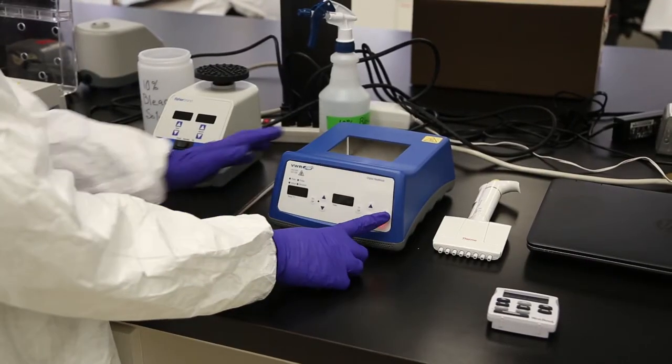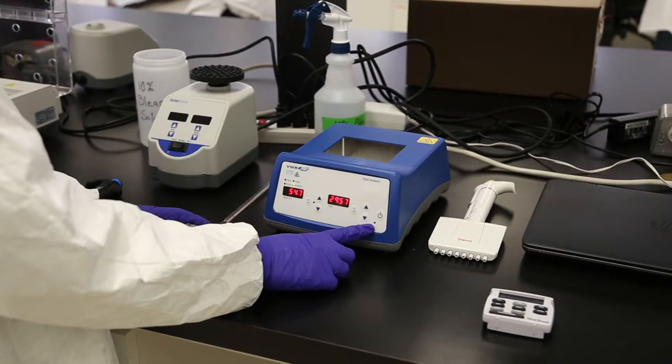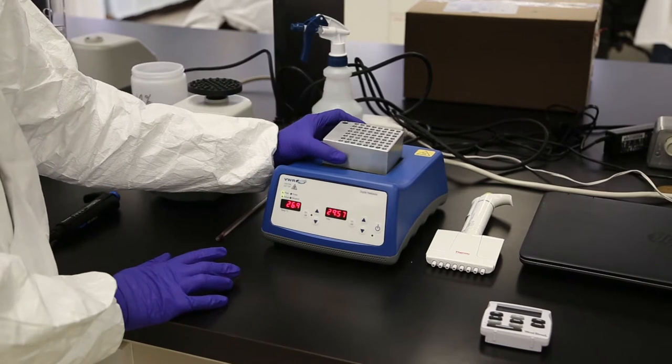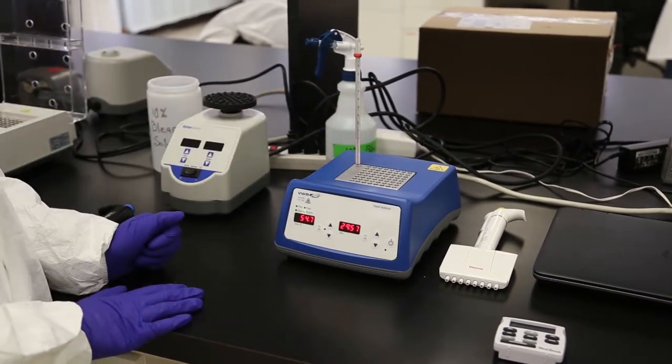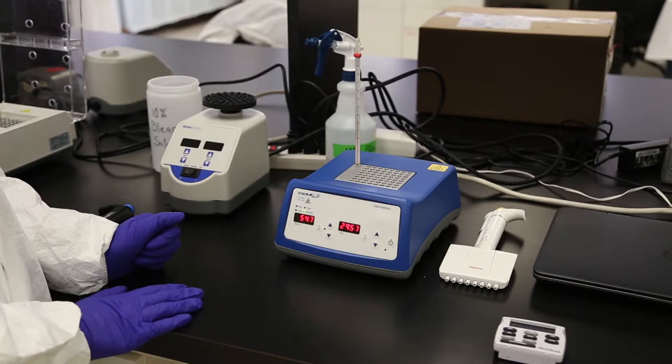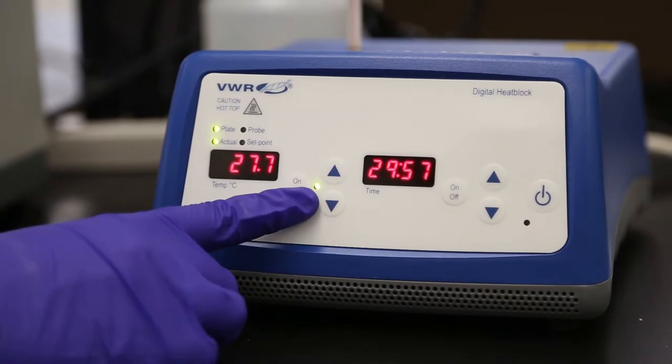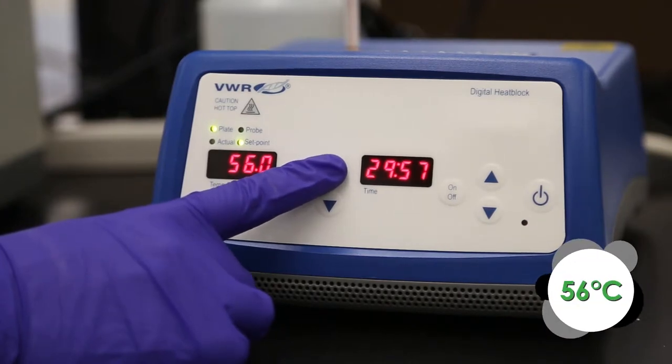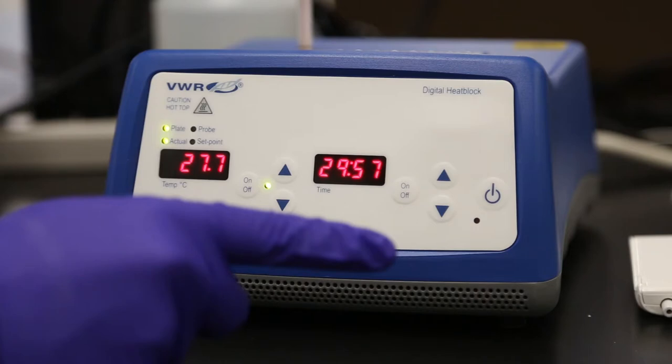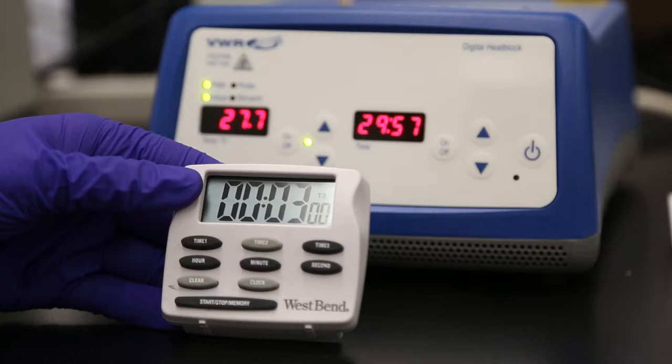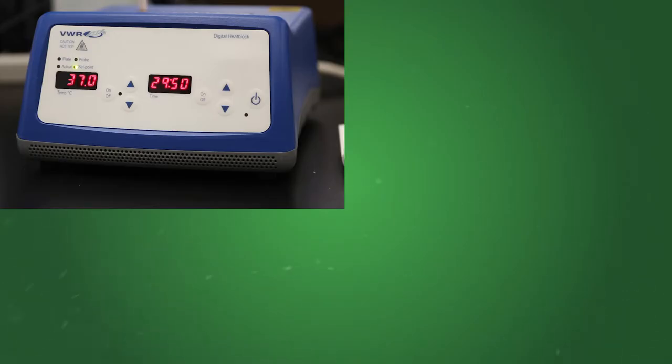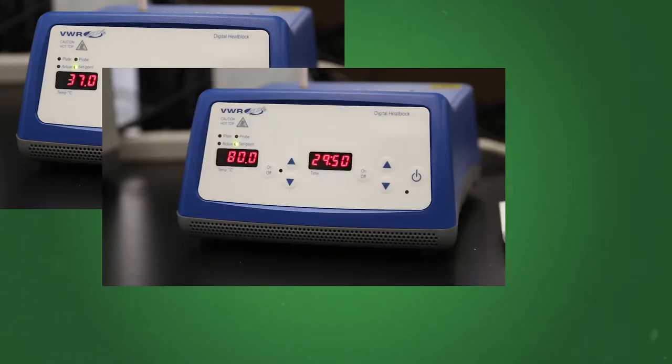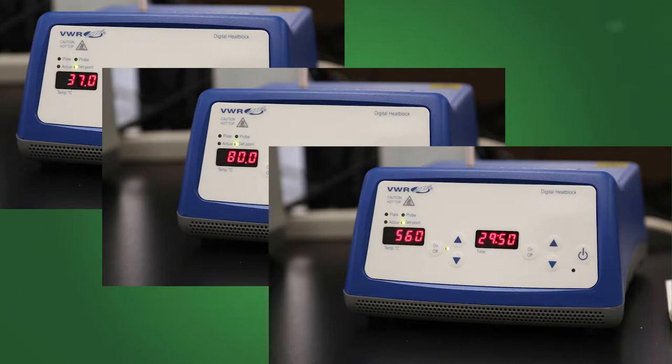To power on the single dry bath heater, press the power button on the front. When powered on, a red light turns off and LEDs display the temperature and time. Place the 64-hole block in the unit. Start the heater by pressing the on-off button. A green light comes on to indicate the unit is heating. To set the temperature, use the up and down arrows to adjust the display to 56 degrees Celsius. Do not use the VWR's timer. Instead, use a timer similar to this one, set to 3 minutes. Remember, the green light must be on for the block to heat.